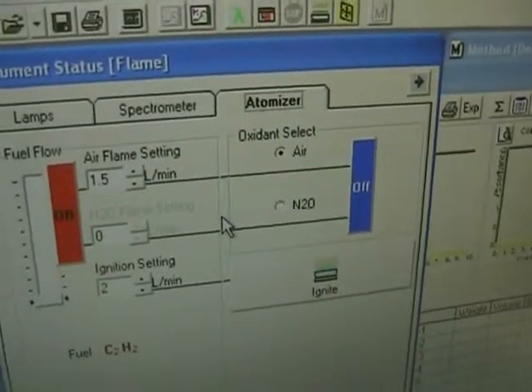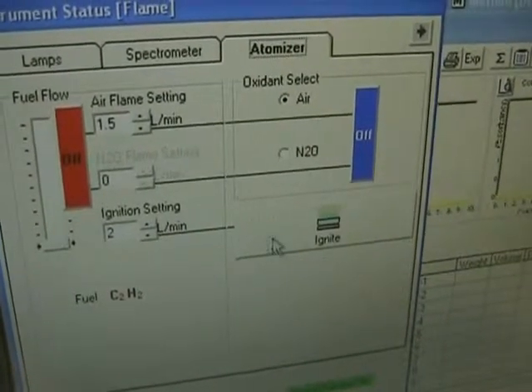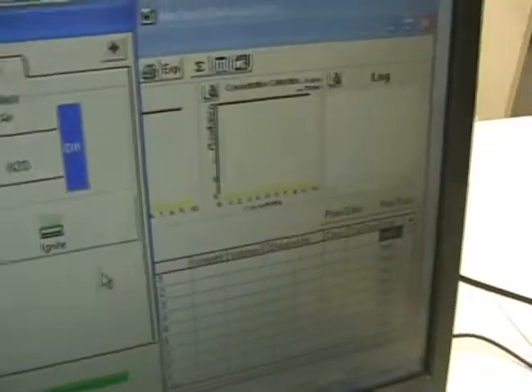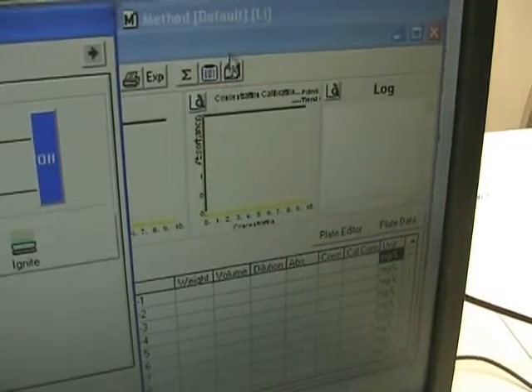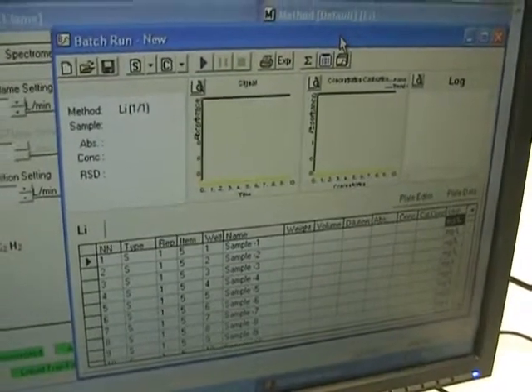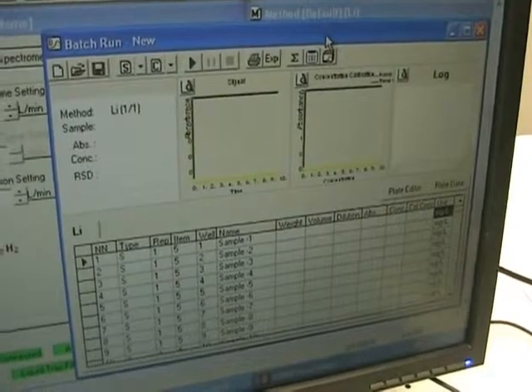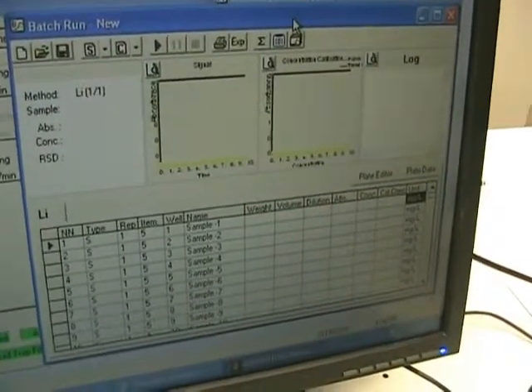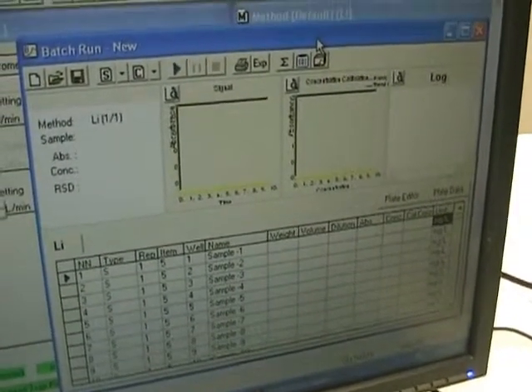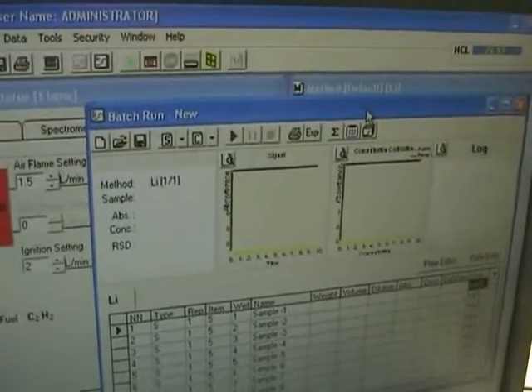We're running air on the atomizer, so we've got that setting there, and you can see the ignite button. We're going to move over to another window to look at some of the readings first. We have a program built for it — we're not really running any samples other than water, so the readings will probably be zero since we don't have any particles that the lamp is tuned to, but you can at least see that it does take readings.